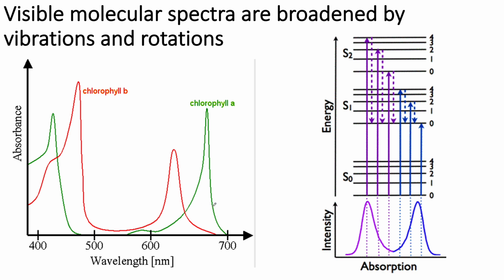In the earlier images, the widths of those lines were usually limited by the spectrometer itself, right? How good the spectrometer is. Otherwise, they become very, very narrow. Whereas these are not due to the instrument. These are due to the fact that not only do you have electronic transitions here in the visible region of the spectrum, but you've also got these rotational and vibrational states.